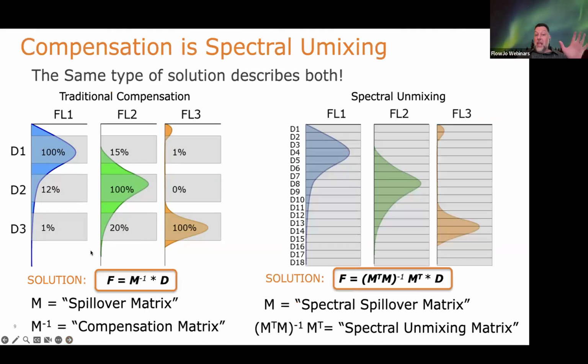Now, the other point I want to make is that this basic example is exactly what we do when we have full spectrum cytometry, or a very similar mathematical equation is used to unmix in full spectrum cytometry, right? So we still calculate the spillover matrix for all detectors. The difference between traditional cytometric approaches is you have space between the filter sets, and the filter sets are designed to only pick up the peak emission, and you aren't considering the entire spectrum.